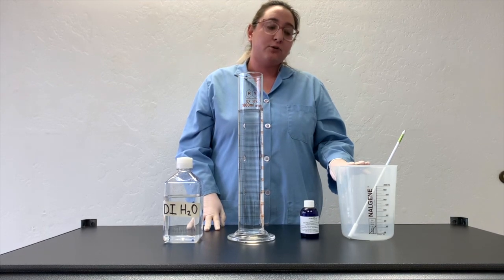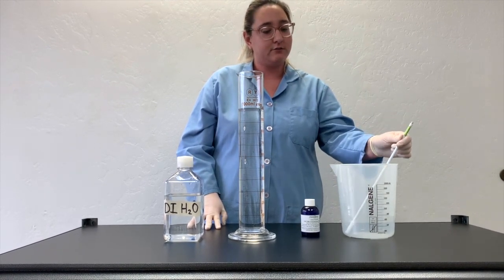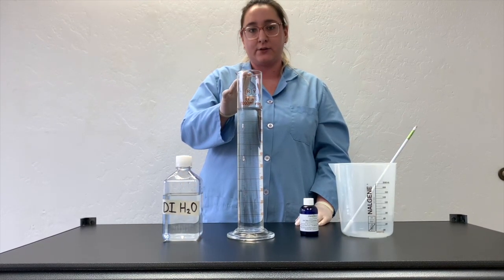We're also going to need a beaker that holds a minimum of two liters, a stirring rod, and I will be using a one liter graduated cylinder for accurate measuring.